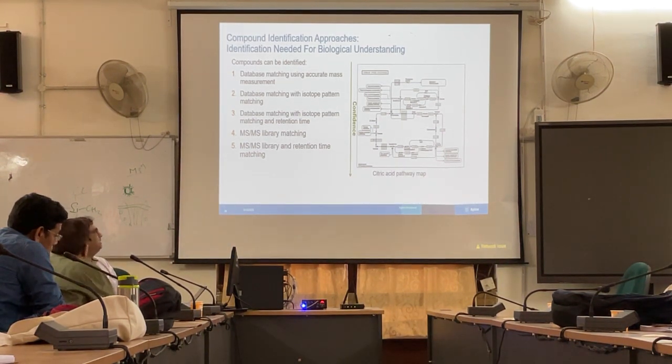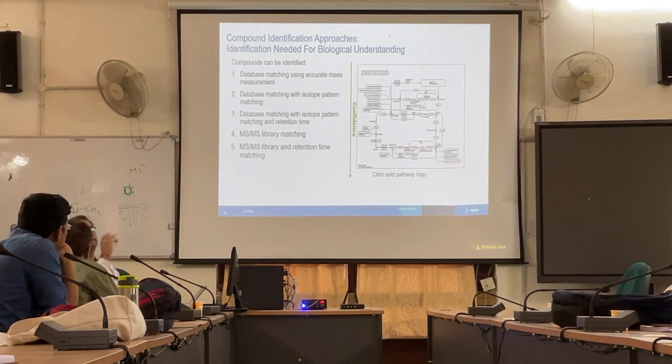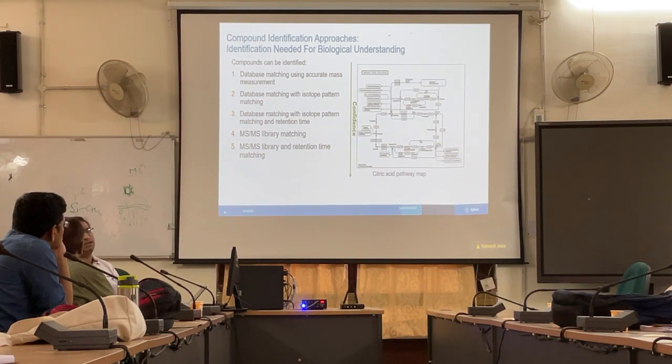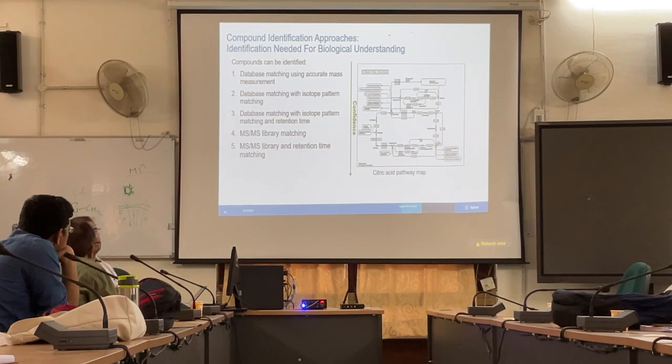So we have a possibility to match the MSMS based on the fragments only and not consider the molecular ion at all, like you do in GCMS. GCMS has established this very well: you get the fragments and you identify the molecule based on the fragments. Same approach you are applying now, but not looking at the molecular ion. So if I get a mass of 230.08, even if I don't match 230.08, so this is the top-down approach, I can go bottom-up also. I can go MSMS match first and then establish the molecular ion. Both are possible. In metabolomics, you have to apply both.